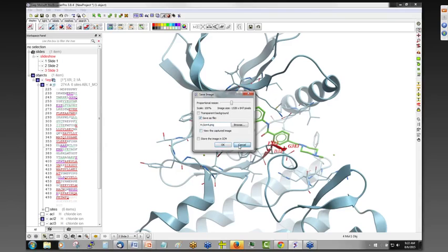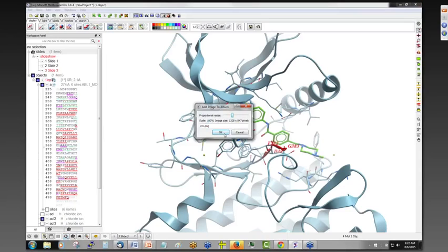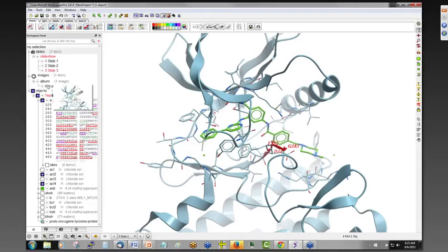And so that's advanced. You can also add the image to an album, which is sometimes useful for molecular documents. So you can add this to the album, and we have this now saved in the ICM workspace. And you can also set it as a background image as well, which is sometimes helpful if you're comparing structures.